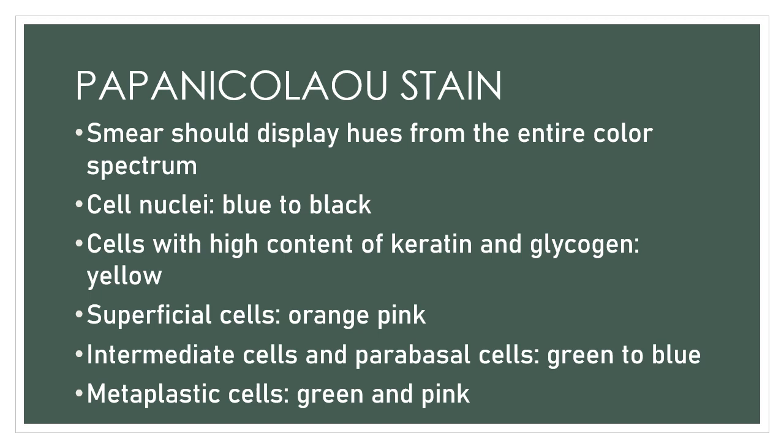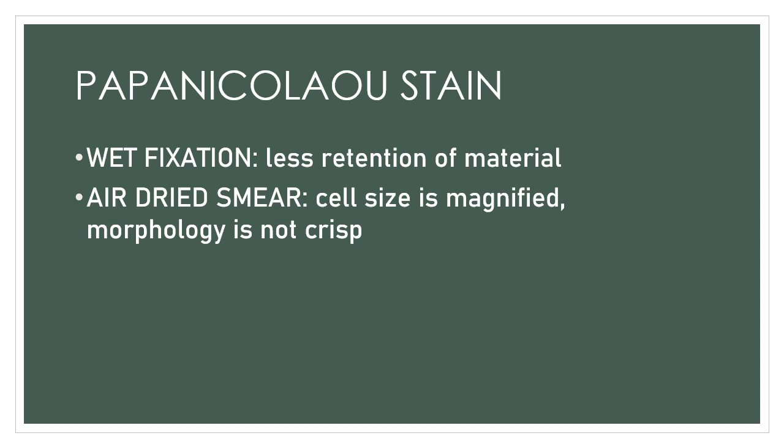If your staining is varied, then of course, you might as well check on your stains, your orange G, and eosin azure. Those stains lose their strength more rapidly than hematoxylin. That is why your OG and your eosin azure should be replaced once a week or as soon as the staining of cells is no longer sharp. Now, wet fixation and air-dried smear.